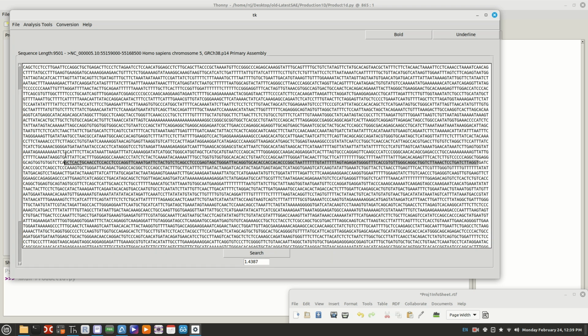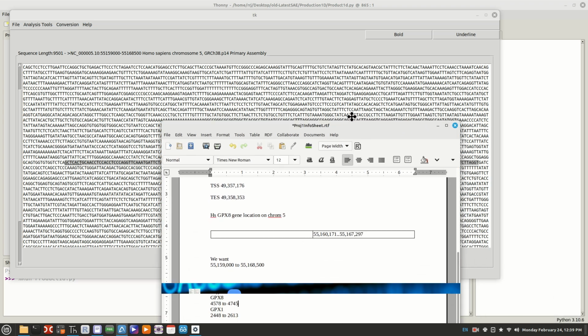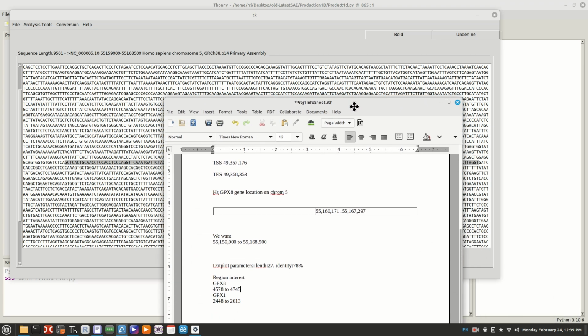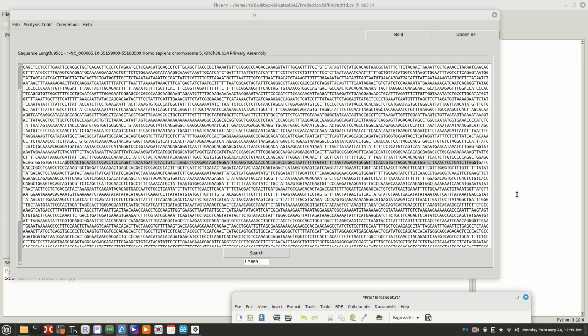All right. So right here is 45.79, and this is 47.45. Okay, it's not that long. It's still roughly 200 bases, or is that right? I saw 150, 160, so 150, yeah, about 160 bases. All right, and this is the area, so I'm going to grab that.